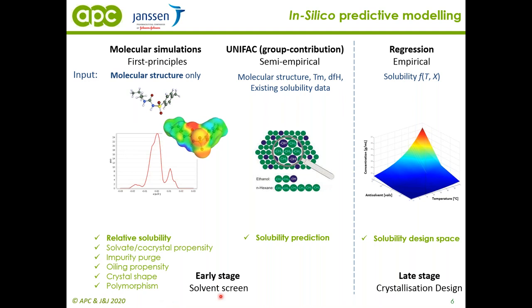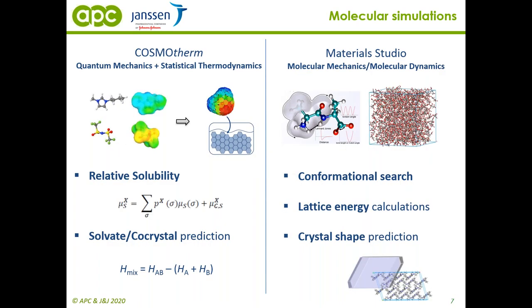there is no data. But once we generate and select a solvent and we go to the lab and do experiments, and once the solubility experimental data are generated, we then input that in the UNIFAC models. So we are using these platforms, and then generating even more experimental data, we end up creating the full map, which is then used for the crystallization design.